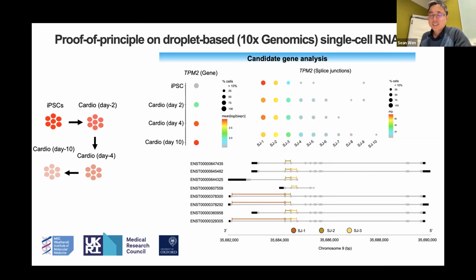And to answer your second question, yes, it can take in the splicing events detected from different software such as rMATS and LeafCutter. All you need to do is format it in the right way, and it can do the rest for you. I'm also using Marvel for bulk analysis, because in principle it can. You can do less things without, but you still can use Marvel for bulk analysis as well if you want to. Yeah. Got it. Great.